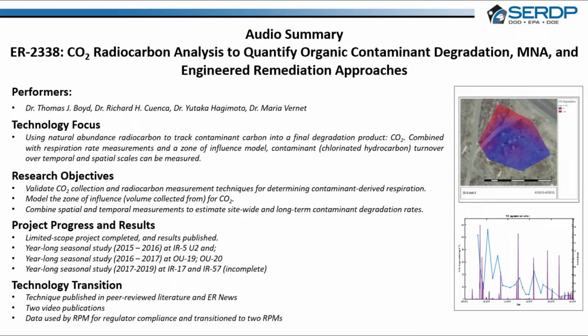CO2 radiocarbon analysis to quantify organic contaminant degradation, monitored natural attenuation, and engineered remediation approaches, ER 2338, was a 3-year effort to demonstrate technologies for measuring in situ contaminant degradation. The technique relies on the fact that industrial chemicals, up until very recently, have been made with petroleum feedstocks.